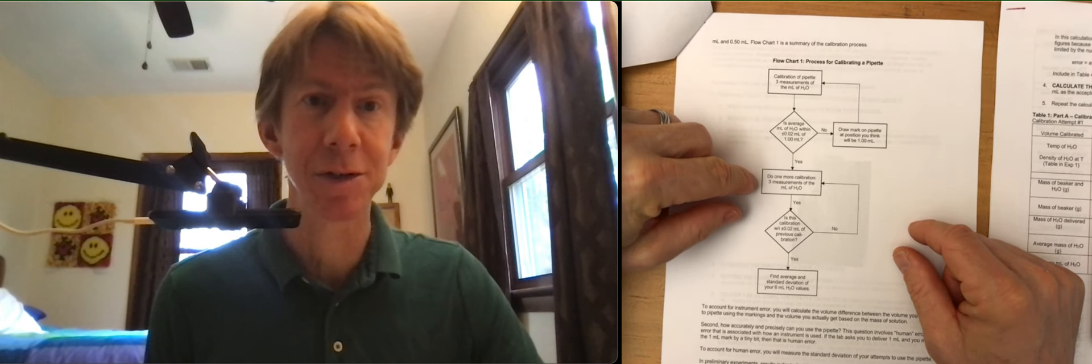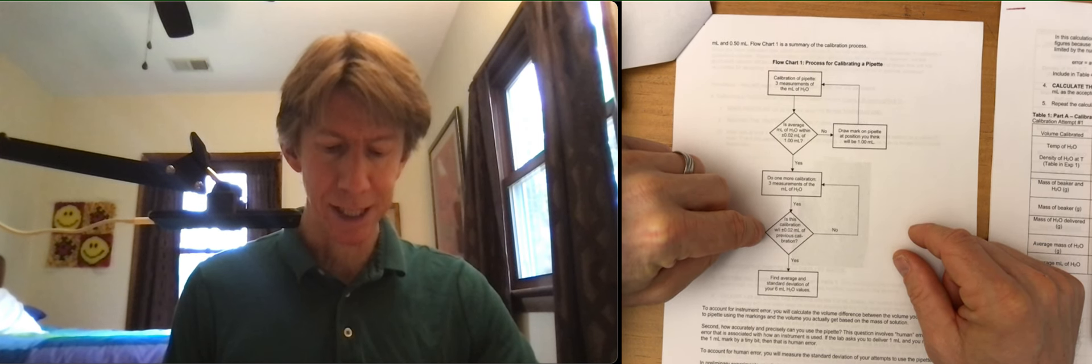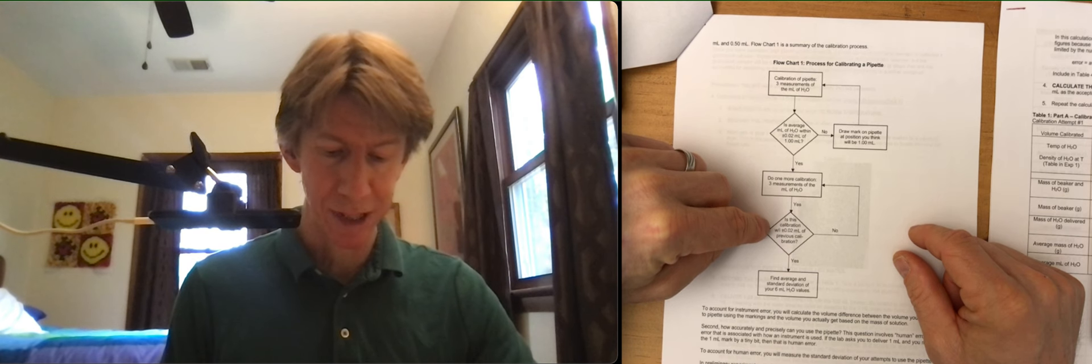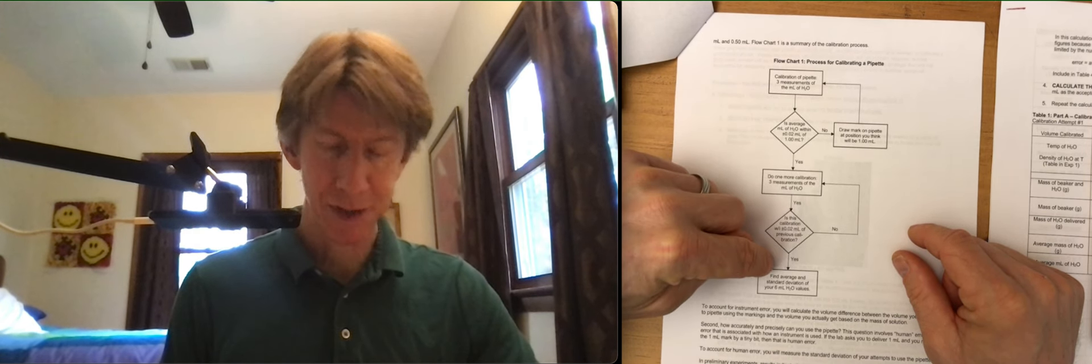Then do three more for a total of six good measurements. And then the second one has to be within plus or minus 0.02 milliliters of the first three measurements. If so you're done.